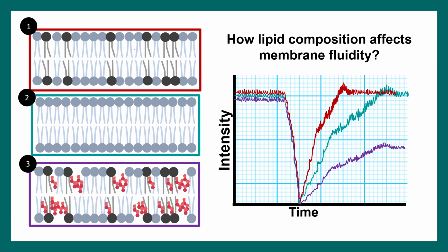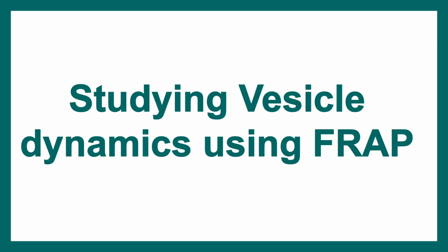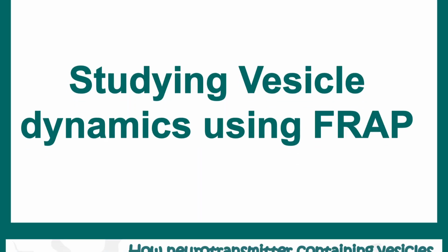So just by looking at the recovery profile, even if we don't know the membrane composition, in retrospect we can assume that this particular membrane might have a different lipid composition that alters the fluidity. Let's study vesicle dynamics using FRAP.